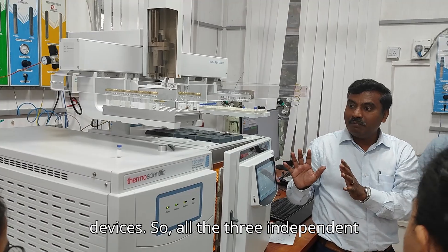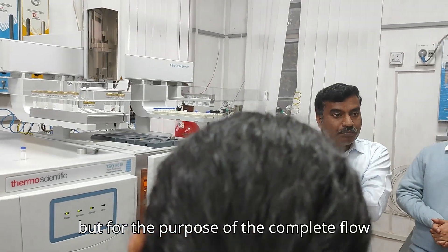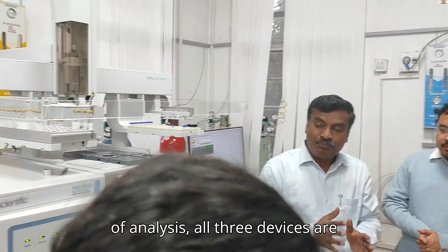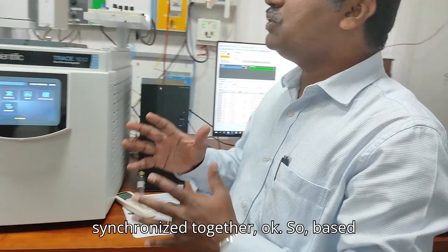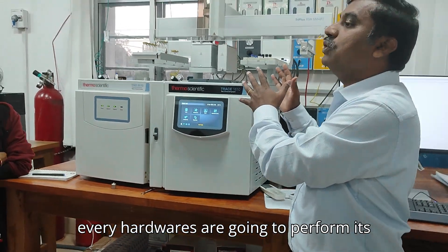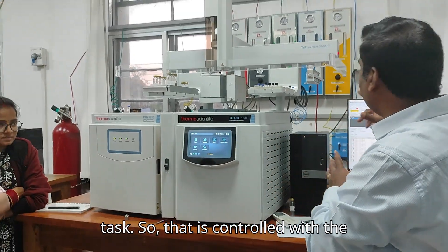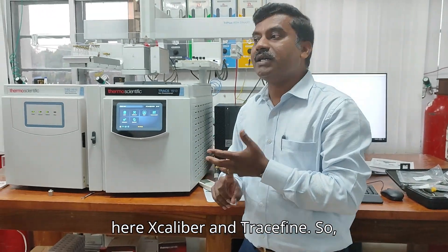All three indicated devices can be controlled in the machine, and for the purpose of complete GC analysis, all three devices are synchronized together. Based on the electronic signals, each and every hardware starts — and that is controlled in the software. The software you have here is Excalibur and RASPINE.